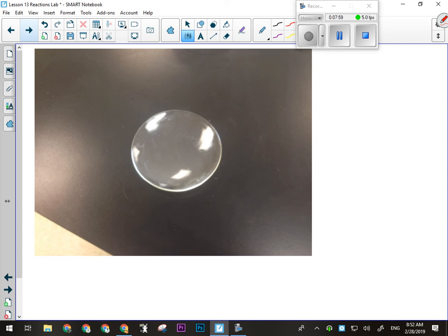What do you have to be really, really careful of with those eyedroppers? If you forget which one you took it from, throw it away. Those eyedroppers are disposable, they're cheap. I don't want the reaction occurring in the source, because there's a lot of it there that could be a bit more energetic than I would like, and then I have to remake the sample, and those are expensive. Eyedroppers are cheap, samples are not. So if you forget, that's fine. Just throw it away, and when one is short, I'll put more in it. Everybody with me there? Super important on that one.